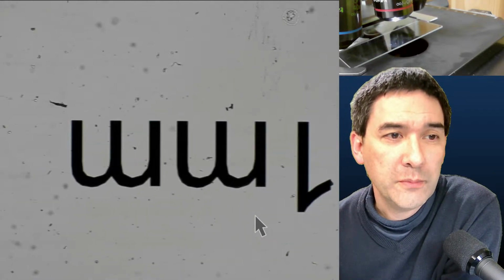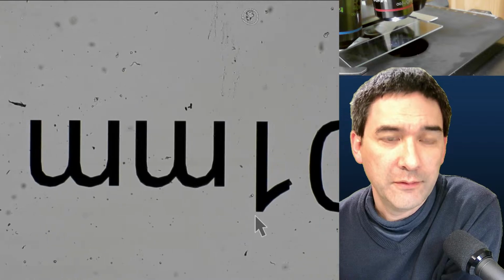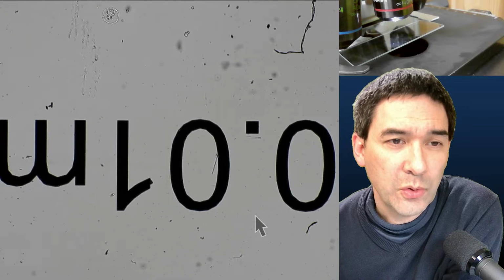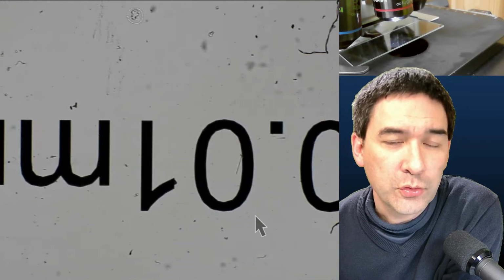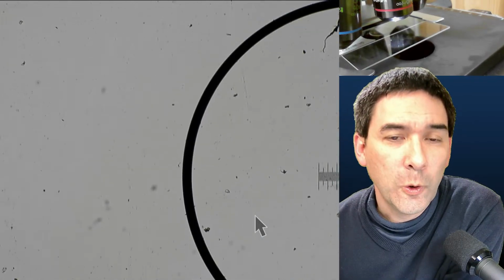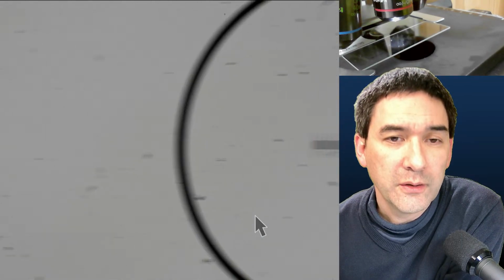Okay. Let's have a look. One division, that is 10 micrometers, 0.01 millimeters. That's the one I want to have. Okay, who cares if it's upside down? So one division is 0.01 millimeters, which is 10 micrometers, which should be the approximate size of a eukaryotic cell. So here we are.